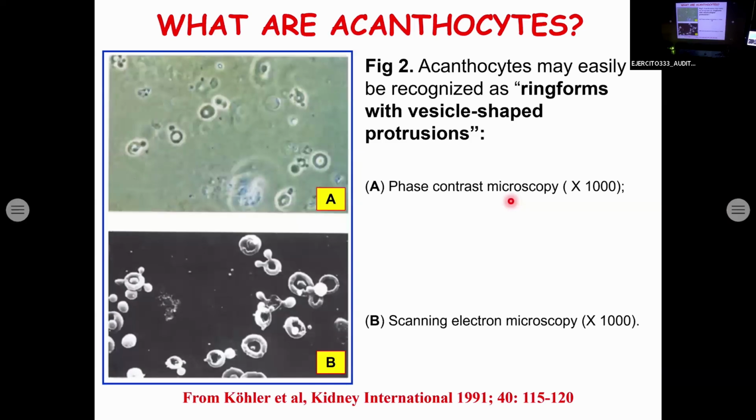Is there here someone who was present yesterday at the practical course? Please. Okay. Please tell us the definition of acanthocytes in Spanish language. La definición de acantocitos. En español. Oh, okay. Anillo is the key word. Okay. Anillo with protrusions, with blebs, one or more.